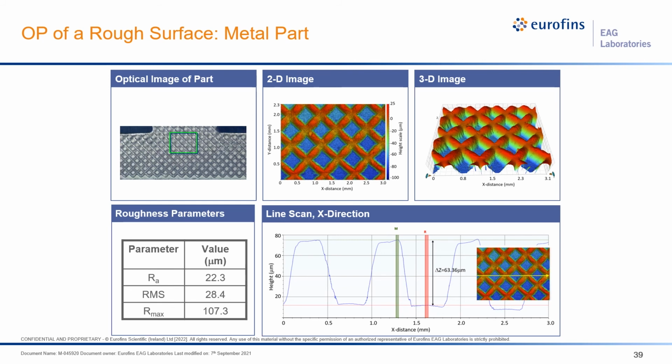The height variations, as you can see, greatly exceed that 150 nanometer cutoff for VSI versus PSI, so this data was collected using VSI mode.